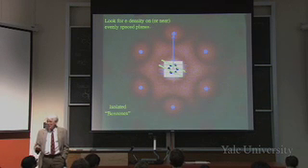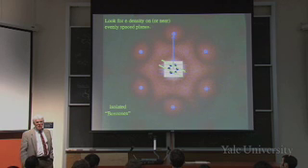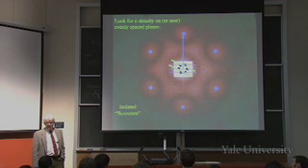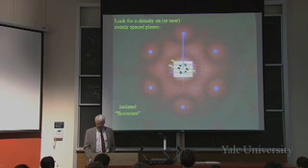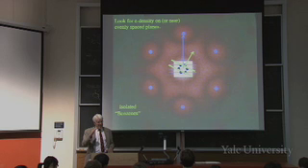Does everybody see that? What does that mean about the angle at which the reflection will occur, or the scattering, where they'll be in phase? The angle will be smaller. So the part of the snowflake that comes from that is here, right? Smaller angle because it's a larger distance.